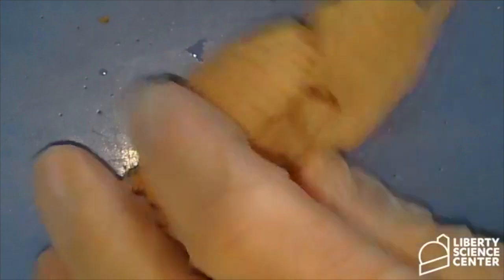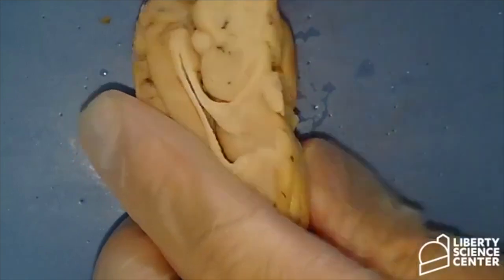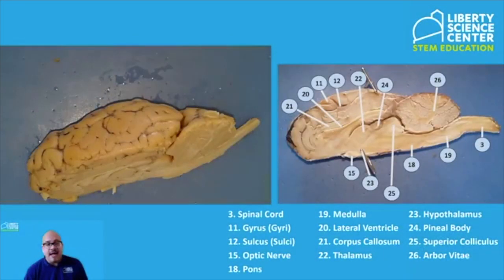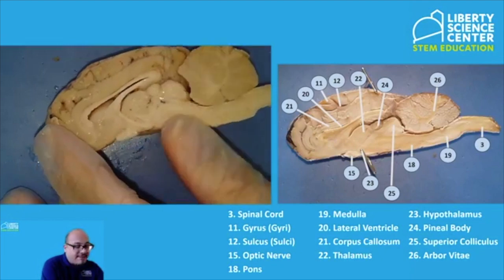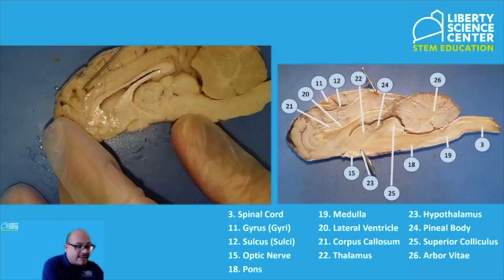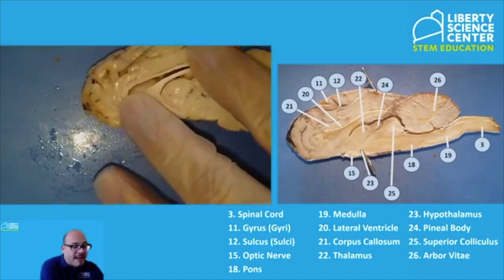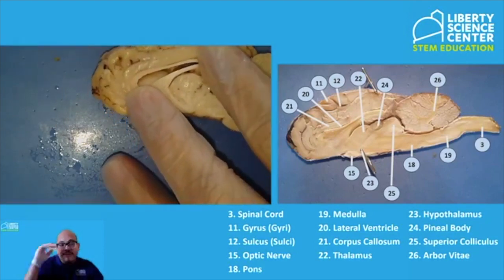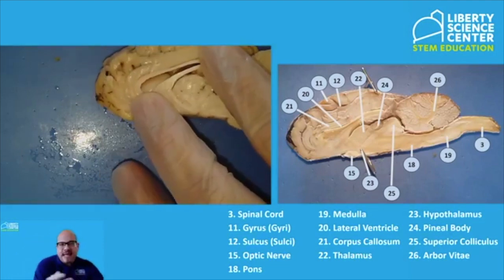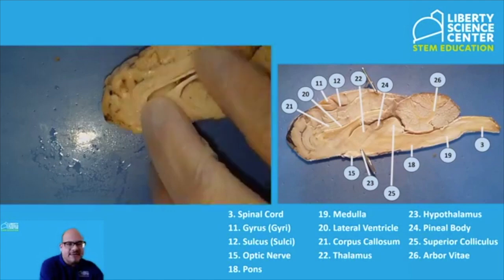One of the really cool things here actually is we have a nice cross section of the optic nerve. If we put it all together, we have our diagram here of the sagittal cut, and those are all the parts right there. We have the spinal cord. We have the gyri, so you can see the little bulges there, and the little linings from the sulci. I know someone mentioned the coloring of the sulci. Is that because of the preservative or are they naturally that way? It's because of the way that the organ is preserved in these chemicals to make sure it doesn't decompose. Sometimes, because of the way that it's preserved, it kind of decolorizes, and the interaction of that chemical gives us that nice little dye view.